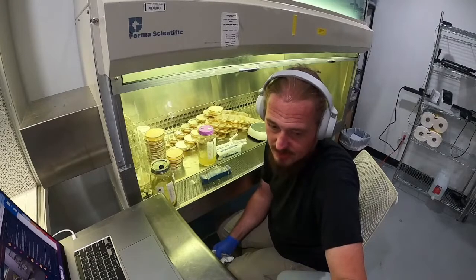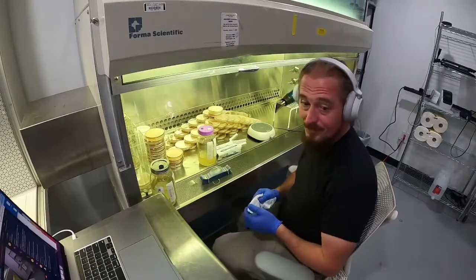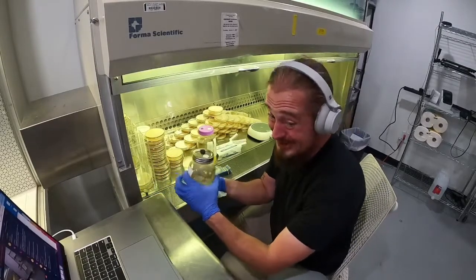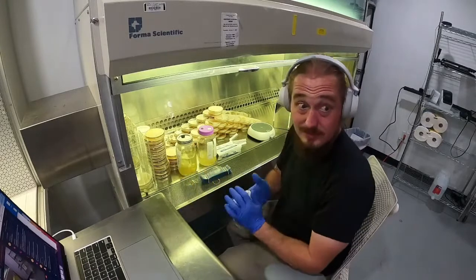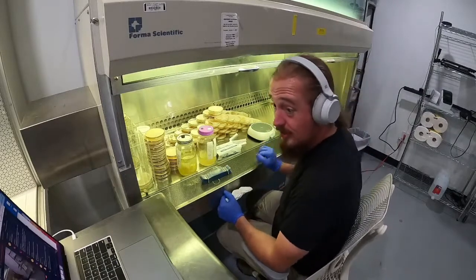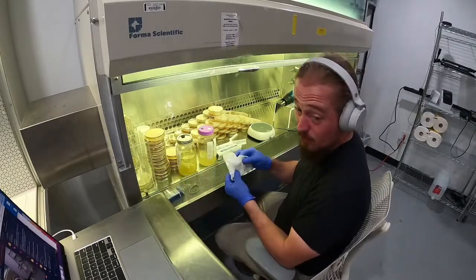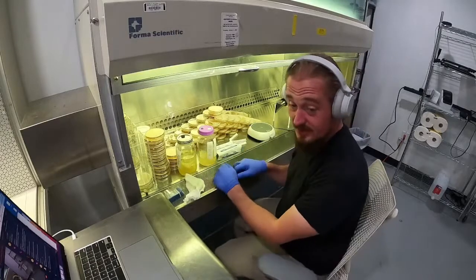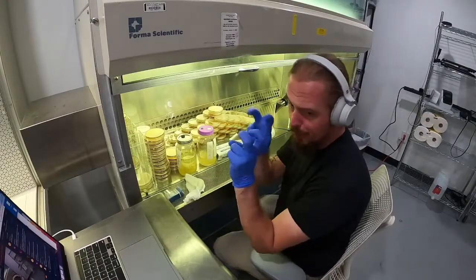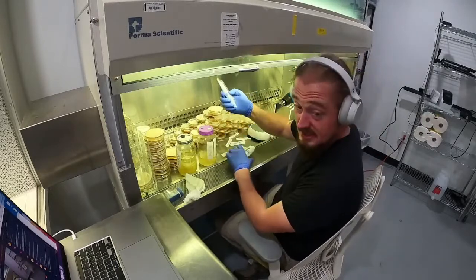Okay, so I still have to go back to the LC versus agar question. But can you do all of that with $40 worth of equipment? Yes, I can. In fact, at home, I don't have a flow hood. At home, I've got my still air box. Still air boxes are bloody amazing, especially if I'm working with contaminated samples before I got this vertical flow hood. That's my jam. Still air box works great. So, you get yourself a $7 Sterilite tub, cut some holes in it. Now you've spent $7 and created a flow hood. Well, sort of. But you can pour agar in it. You can pull LCs, make LCs.